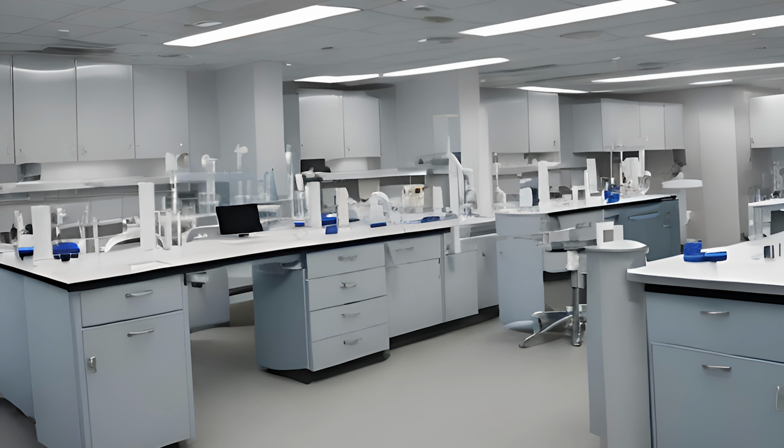These quadrants are also going to be labeled with a number. The higher the number, the more dangerous the chemical contained within, going all the way up to the number 4. A chemical, for example, that has a fire hazard of 4 is something that could spontaneously burst into flames at room temperature without you having to light it on fire. It can just catch on fire on its own.